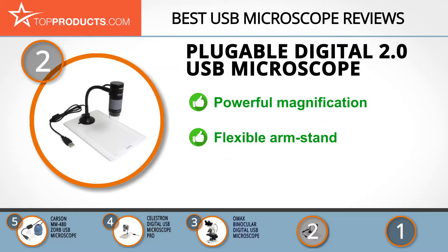The Plugable Digital USB Microscope allows you to view the microscopic details of your specimens. It also has a flexible arm stand that you can adjust to any height or angle, as well as a gray focus ring to bring the object closer for better observation. Sadly, you will need to regularly clean the suction cup lever as it gets dirty with frequent use.